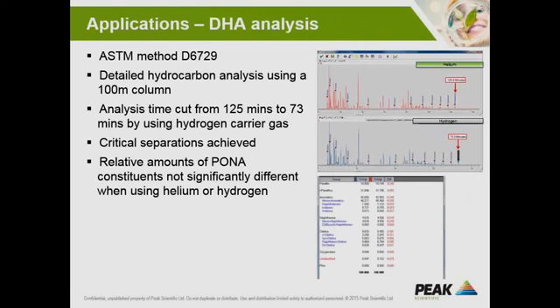Quickly just show you the detailed hydrocarbon analysis example. And by the way, all of these application notes are available on the Peak Scientific website, and I'll give you the address that you can find those at the end of the webinar. So this is an ASTM method which was revalidated, or available for revalidation, from helium to hydrogen.